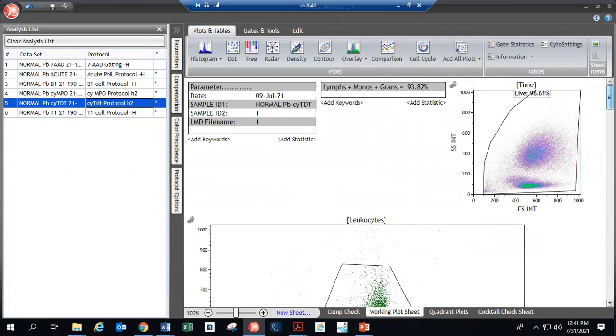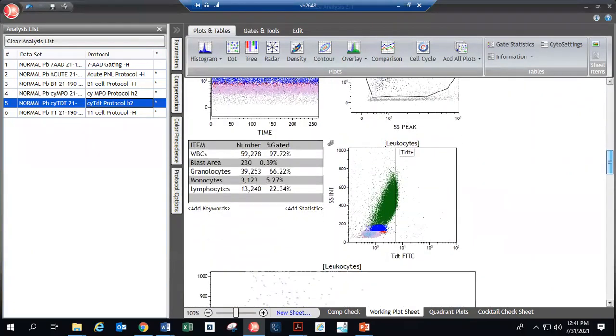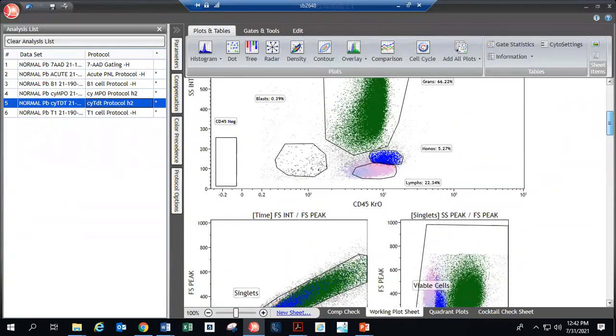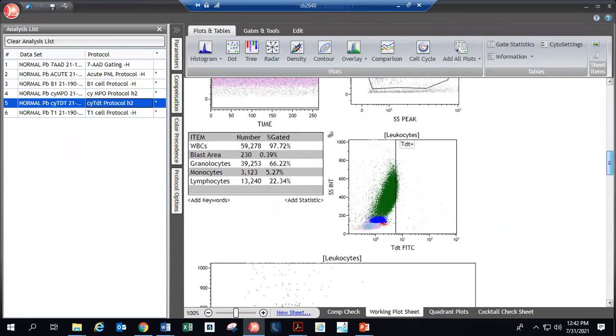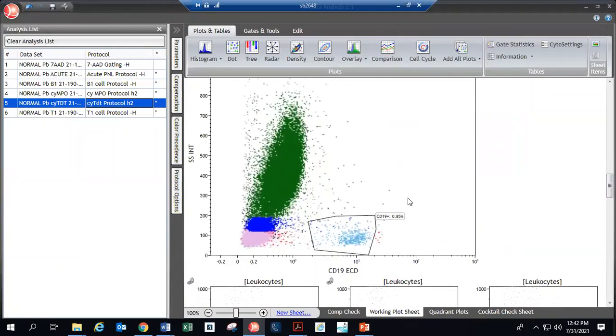Sorry for interrupting. I think that CD19 positive one, are they the normal B cells or are they hematogones? They are dimmer on CD19. I think the normal B cells would be stronger on CD19 than in other plots. Remember one thing, that hematogones are not seen in normal peripheral blood. Oh, okay. Yep. So these are normal mature B cells. Okay, got it. Good. Thank you.